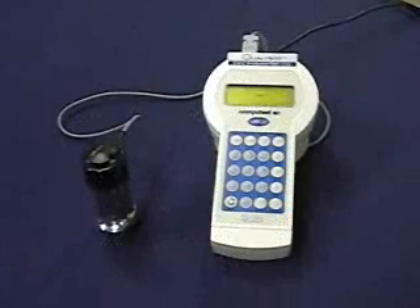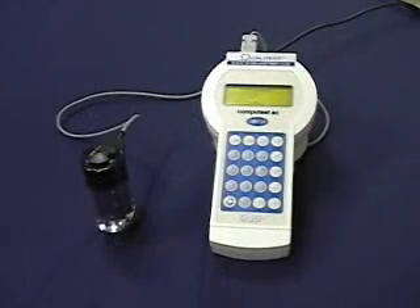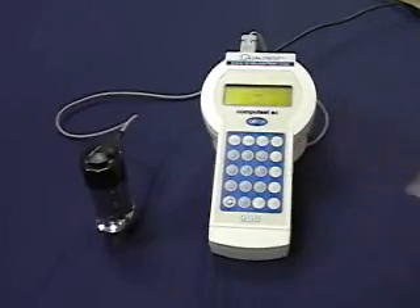To use the CompuTest, first push the scale button. You can choose any scale that is displayed. The CompuTest can also accommodate any hardness scale being used today. In this instance, pick F1 for Rockwell C.